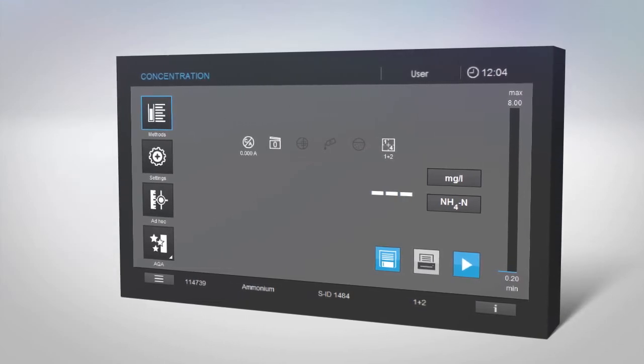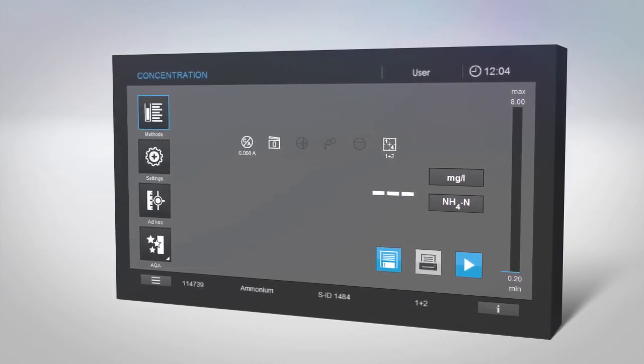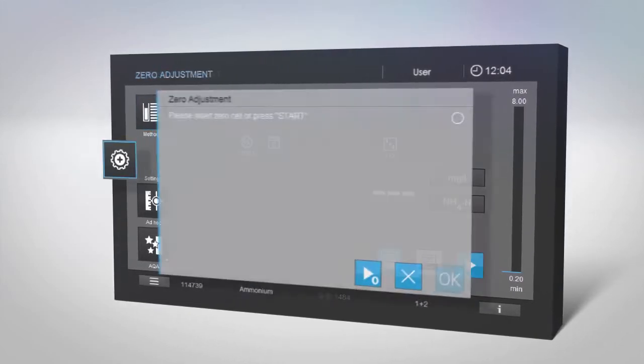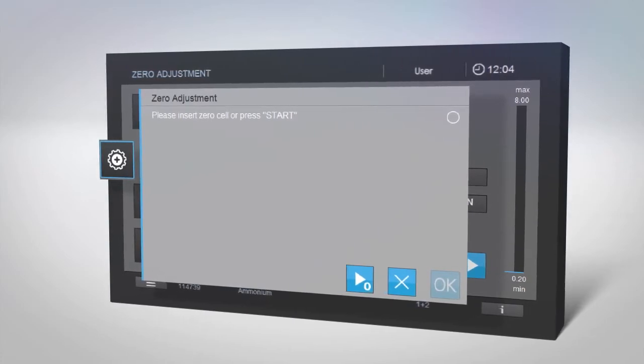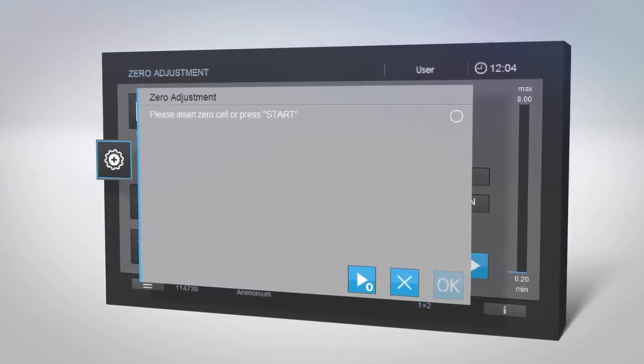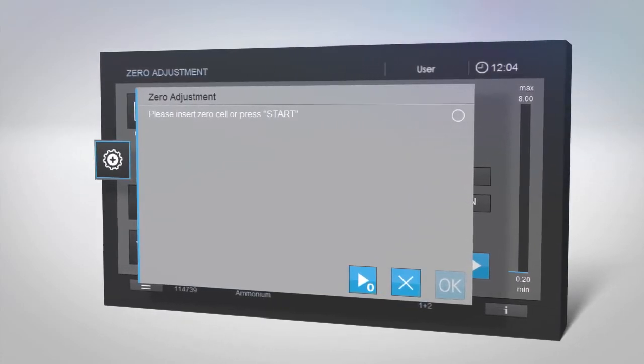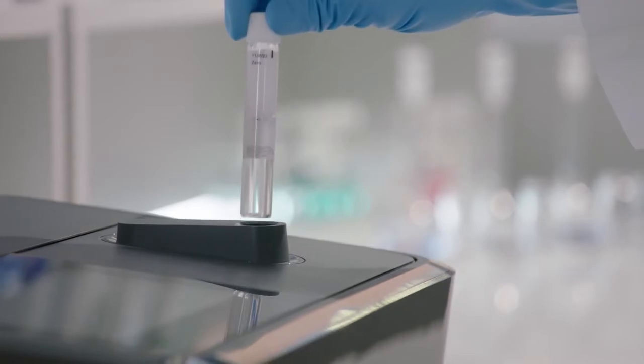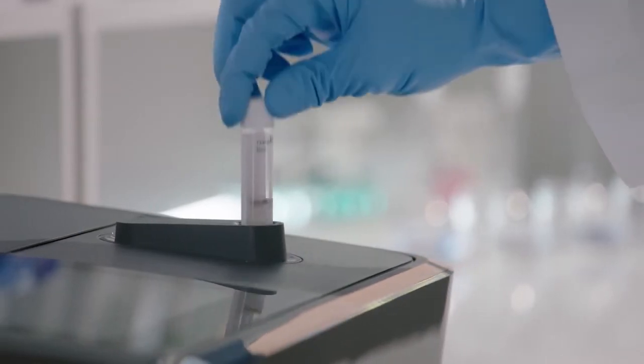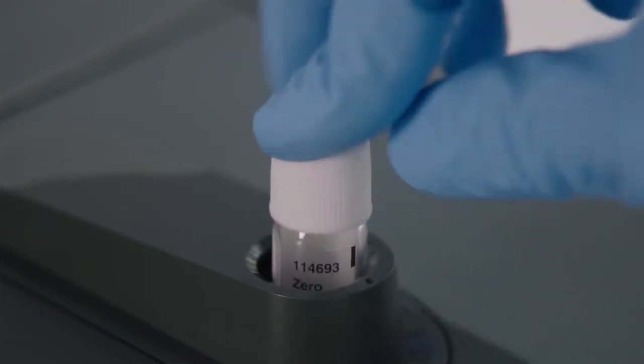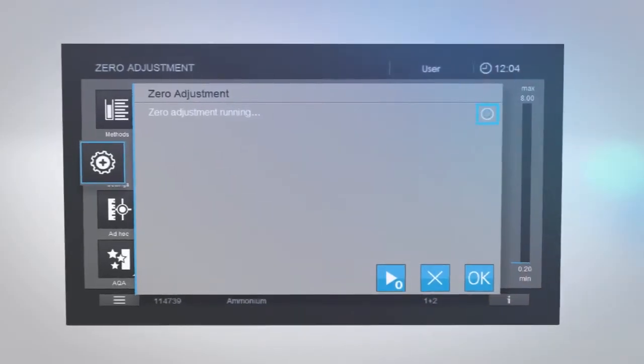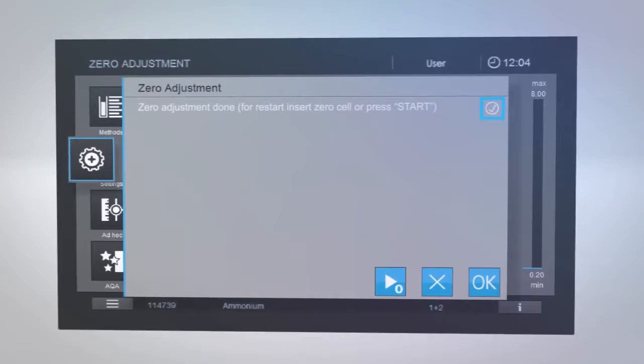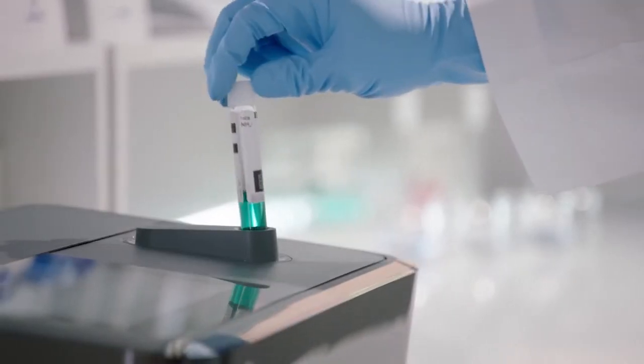When using a cell test kit for the first time, you will be asked to perform a zero adjustment. You will need the zero cell which was supplied with SpectraQuant Prove. Replacement zero cells are also sold separately. Insert the zero cell and the measurement will start immediately. Then insert your sample again.